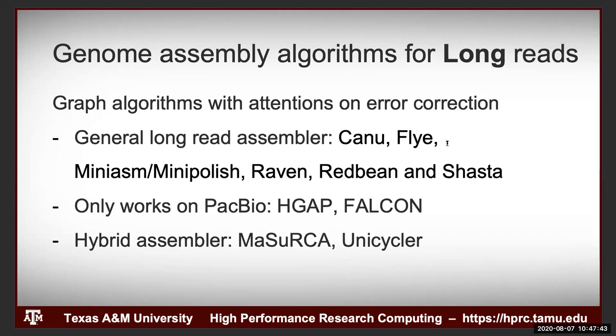And I compared those assemblies. So Canu actually gave you better results. You see longer assemblies. Flye gave you shorter contigs, but finished much faster and took fewer resources. And so it's something to take into account when you're trying to pick a tool for your long read assembly.